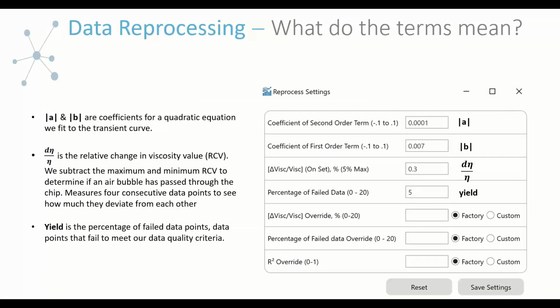I think you may be addressing this now. The question that's coming in is what criteria is used to flag the data from that segment that was flagged as red? Oh, yeah, that's a great question. That is exactly what I'm going to be talking about right now. Thank you.